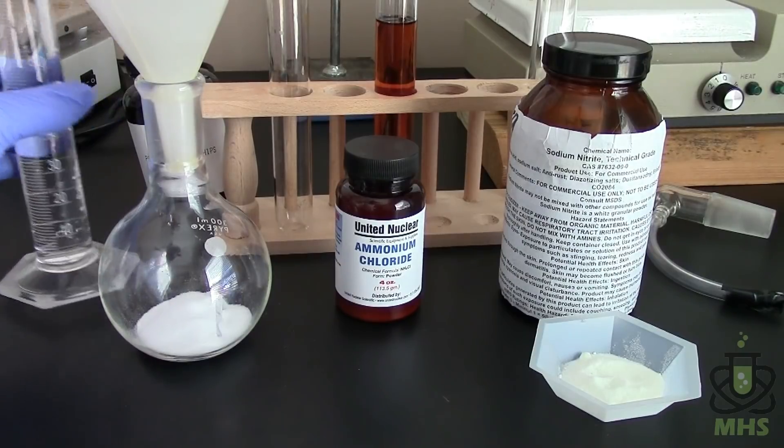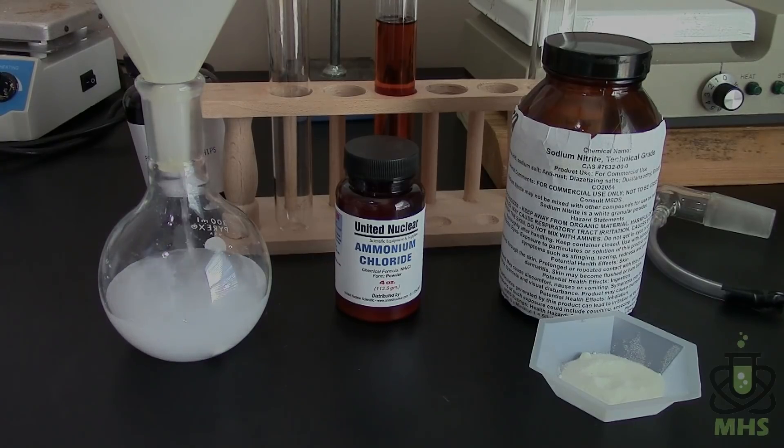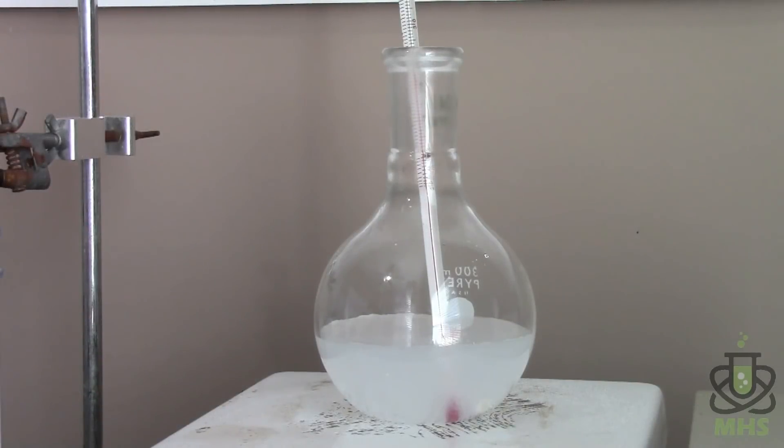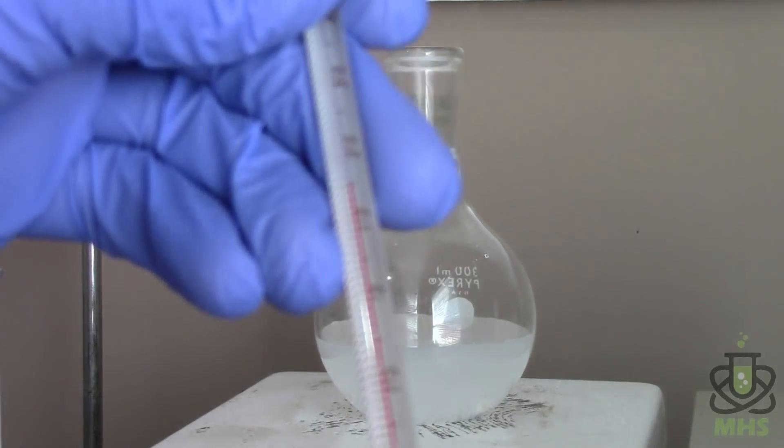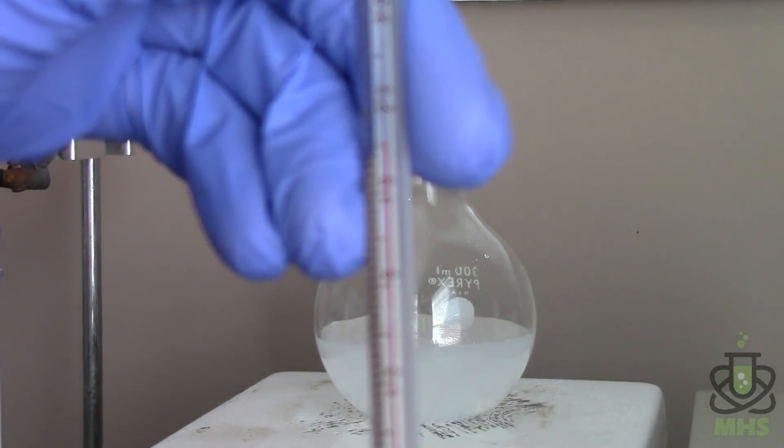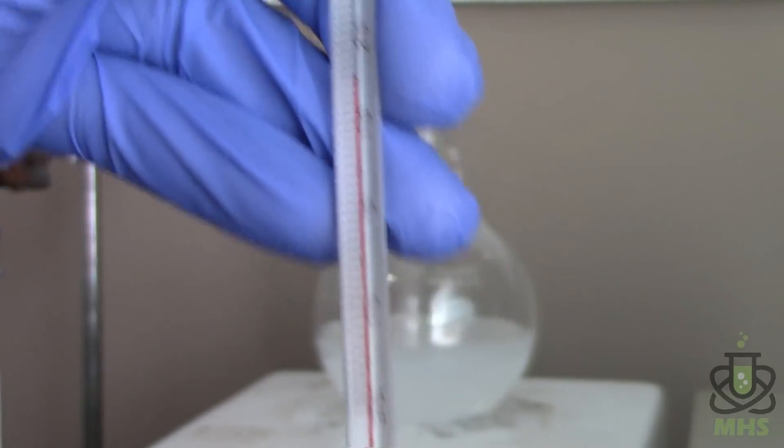So first of all let's go ahead and dissolve the ammonium chloride into the 100 milliliters of water. So just dissolving the ammonium chloride is actually endothermic. So the room is about 25 celsius and the solution is about 15 degrees. So pretty cold.